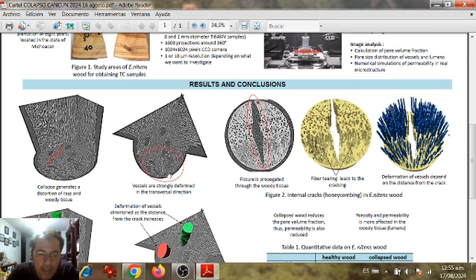We notice that the vessels that are very close to the larger deformation of tearing are highly deformed. So we can also notice that this deformation is caused by the pressure of the woody tissue that is in this way.